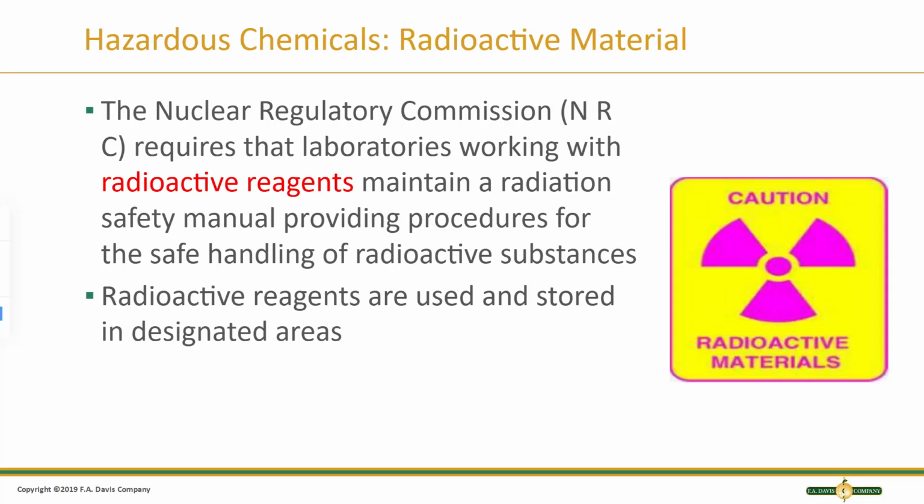The Nuclear Regulatory Commission requires that laboratories working with radioactive reagents maintain a radiation safety manual providing procedures for the safe handling of radioactive substances. Radioactive reagents are used and stored in designated areas.